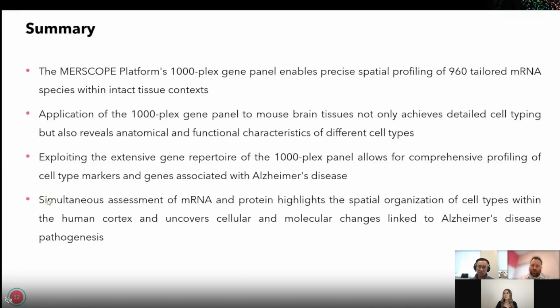Great. Now, do you recommend the use of spatial information when clustering? That's a very interesting question. So far, the analysis I did is first just using the molecular information to do that, and then to assess the spatial relationship or the correlation between the spatial distribution and the molecular features. But I know there are some algorithms that have been developed that can use both. In my experience, I always find these two are correlated.